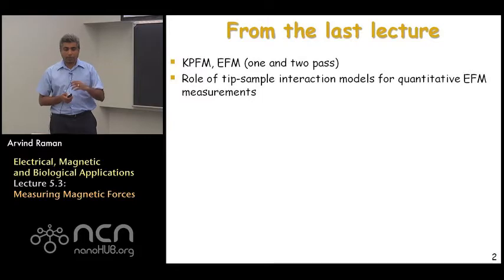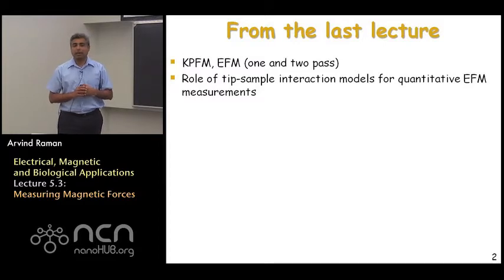What we'll talk about today is magnetic force microscopy and how to measure magnetic forces. Much of what you're going to see in understanding magnetic force microscopy is going to be derived or based on similar principles as electrostatic force microscopy, except there are a few interesting specialized twists or specialized things that need to be taken into account while doing magnetic force microscopy.